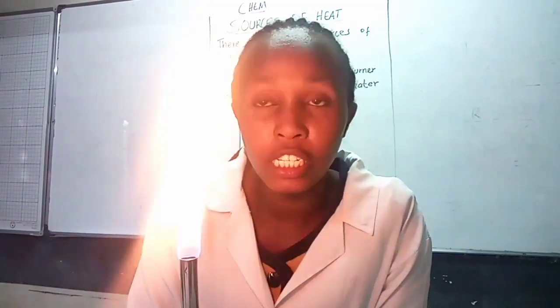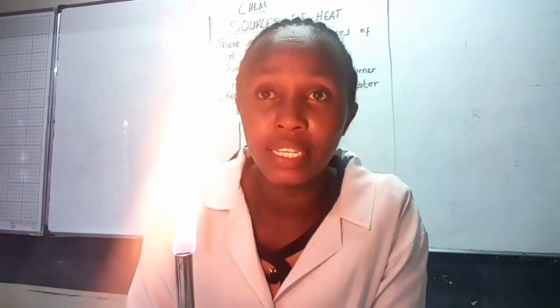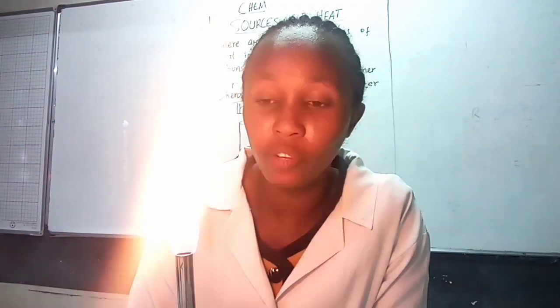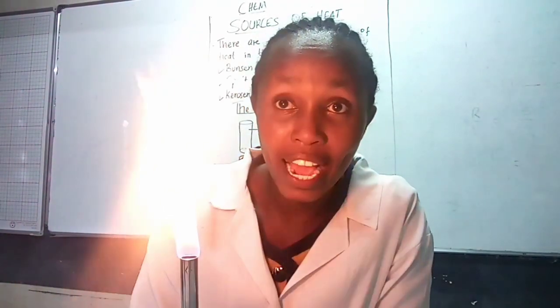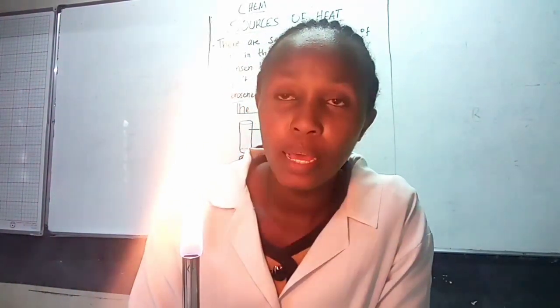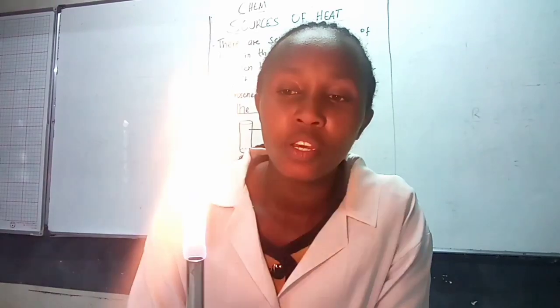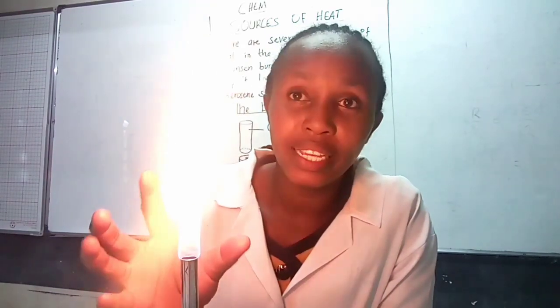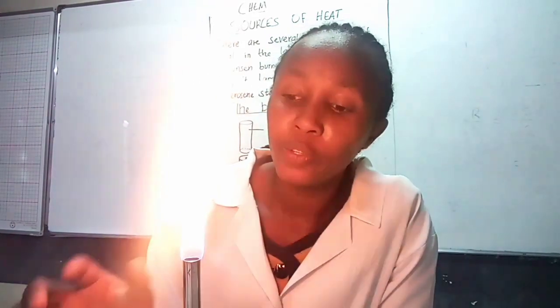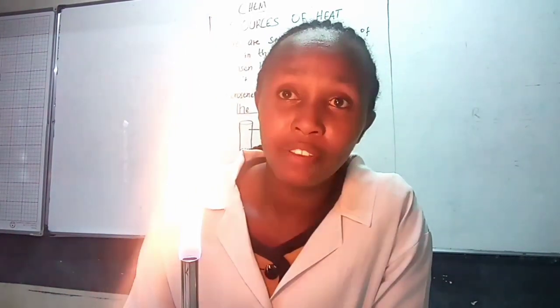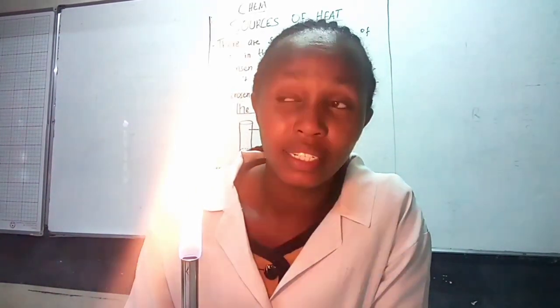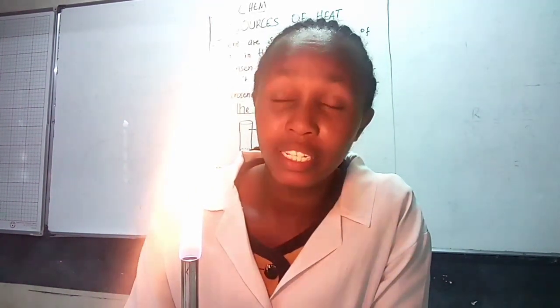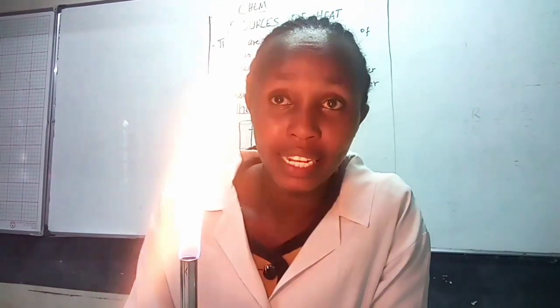This flame is best used in the lab to avoid fire accidents, because you can see how visible it is — you can easily tell you have a flame and therefore it is easy to avoid an accident.